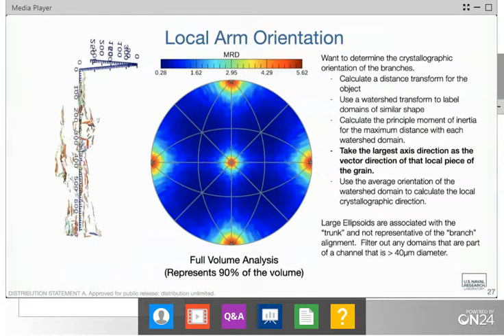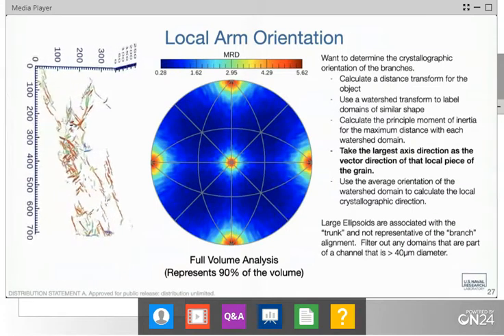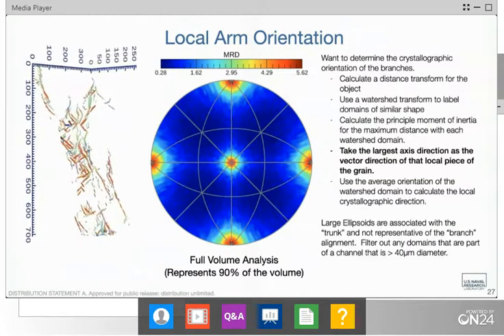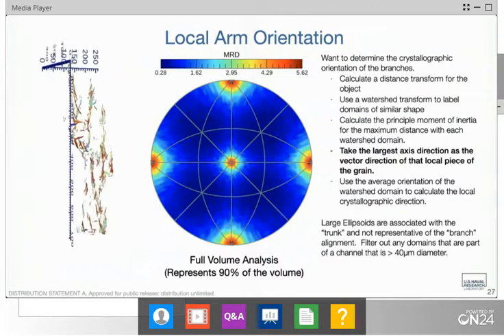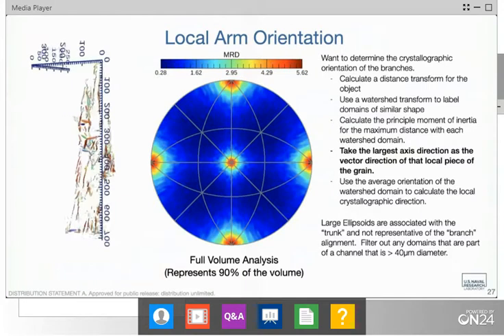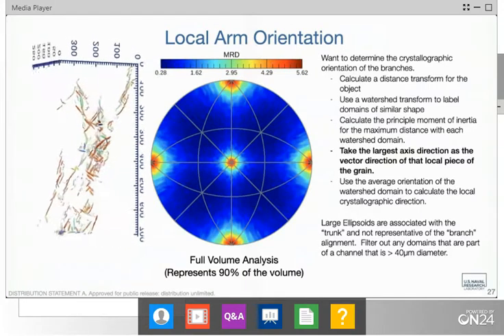I think one of the things that is unique is that we are running this for days and days on end, which is admittedly a very difficult set of troubleshooting to do if you do have problems. But we found it to be reasonably stable.